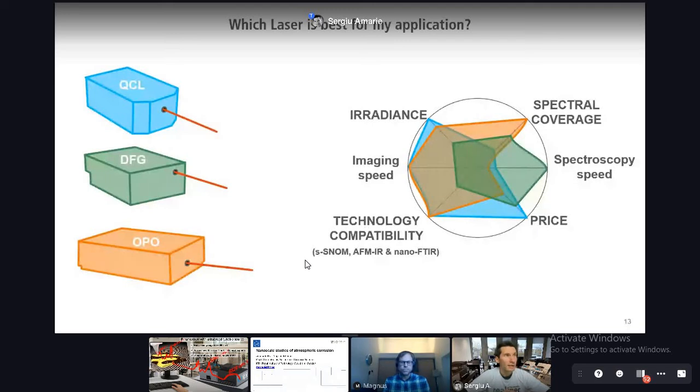For nano-FTIR, it turns out that you do not need to measure in different modes, so you get both the transmission-like experiment and the reflection in one run. It is going a little outside the topic of this webinar, but I encourage you to watch the webinar on polymer science, where we explain in detail how this works. Thank you, Varun, for this wonderful question.